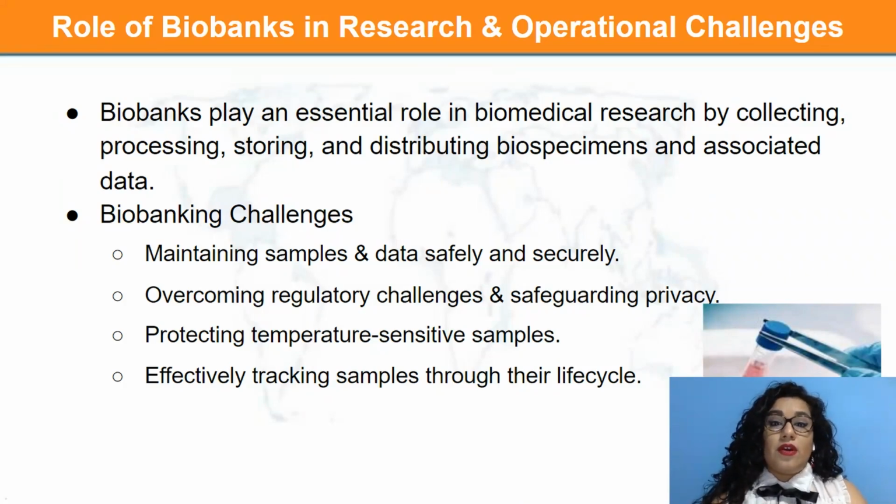It is also necessary for biobanks to track the samples through their life cycle to avoid problems like misplacing samples. So by complying with standards such as ISO 20387, biobanks can assure sample quality, integrity, and traceability through the sample life cycle.